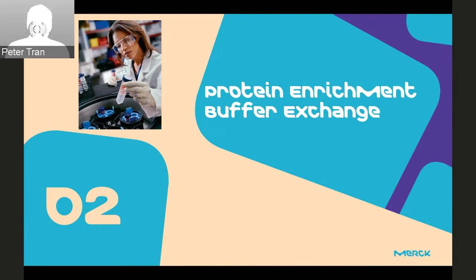A few seconds. Okay, so it looks like most of you chose dialysis. Some chose ultrafiltration, some do protein precipitation.